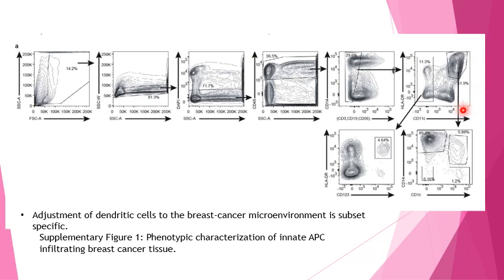And then from there, they looked over here. CD11C is a dendritic cell subset. So that's this, and they did it against the HLA-DR. None of their graphs have their fluorochrome, so I'm not sure which fluorochromes they're using in these. But we can see our positive population for the HLA-DR and our negative, as well as our positive CD11C, and then our double positives over here.